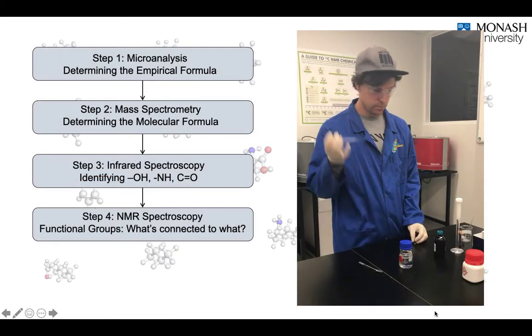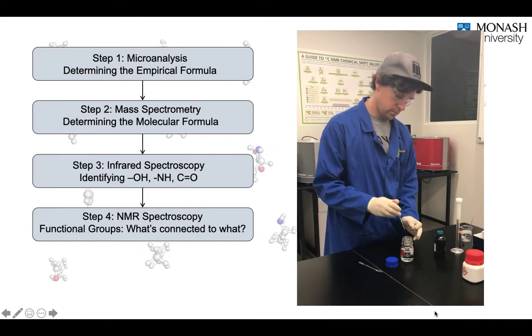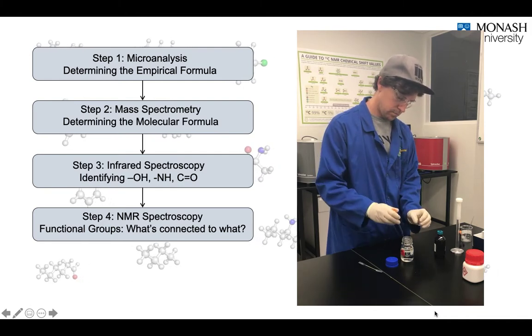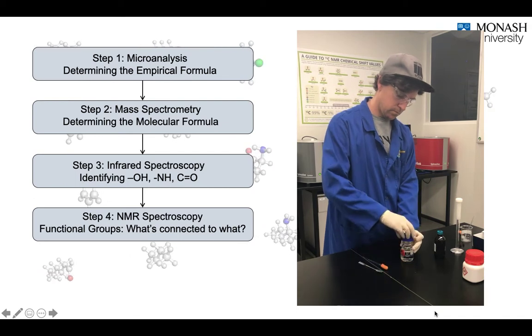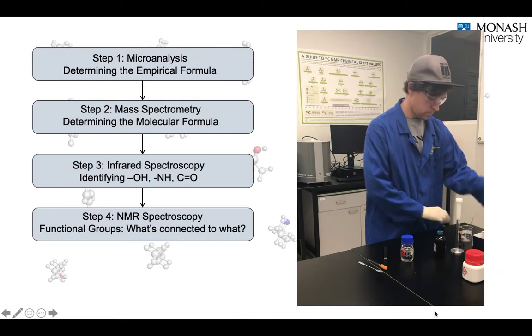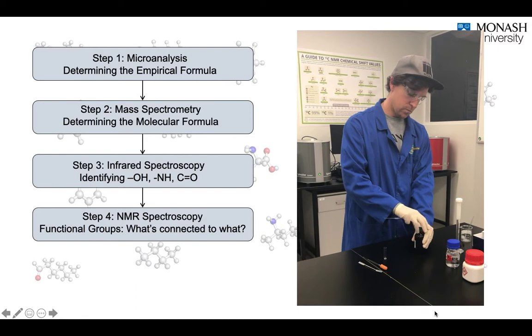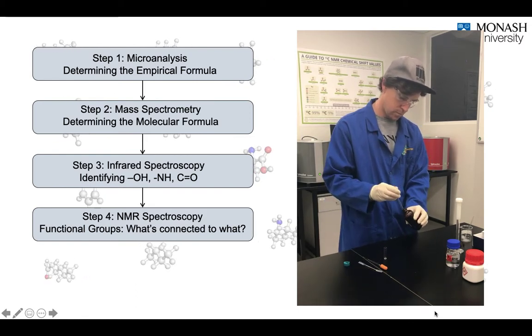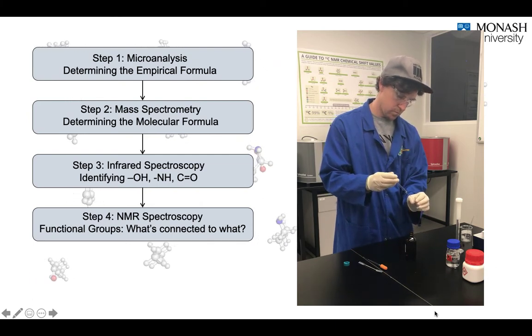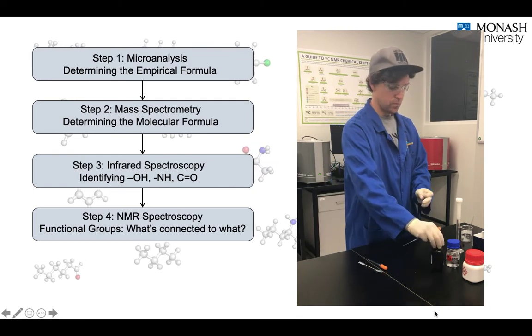In this video here, you can see my colleague, Dr. Clint Woodward, preparing an NMR sample. The first thing he's doing here is taking the molecule of interest and putting it into a small vial. But to measure the NMR spectrum, you don't typically measure the sample in a pure form. It needs to be dissolved in a solvent. Of course, here's the catch. Most solvents themselves have hydrogen atoms. So to avoid getting those hydrogen atoms measured in your NMR spectrum as well, the solvent that Dr. Woodward is adding here is a deuterated solvent.